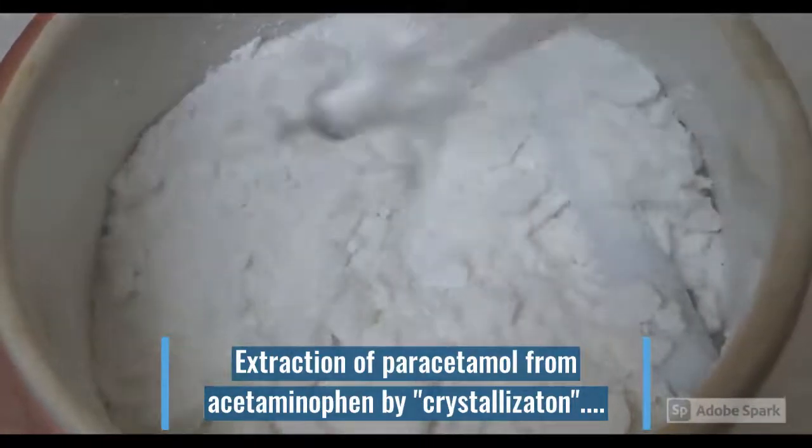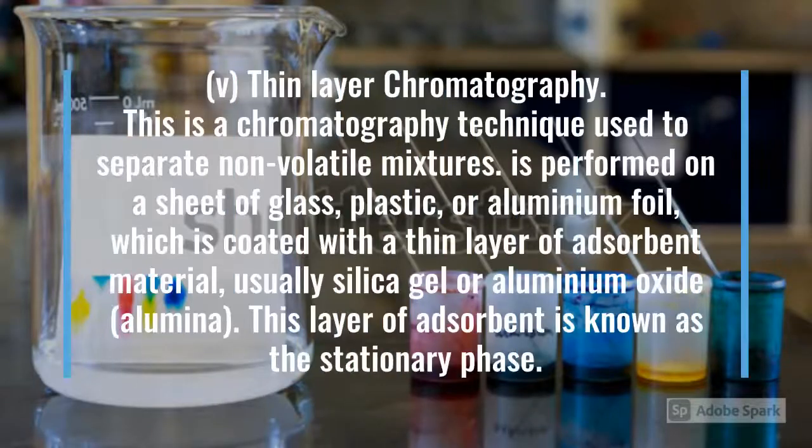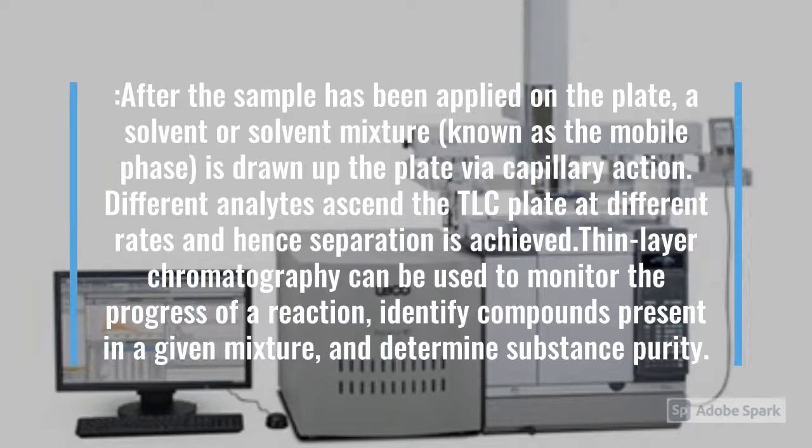Now, let's move on to the last separation technique in this topic, that is thin layer chromatography. This is a technique which is used to separate non-volatile mixtures, and it is performed on a sheet of glass, plastic or aluminum foil, which is coated with a thin layer of adsorbent material such as silica gel or aluminum oxide, also known as alumina.